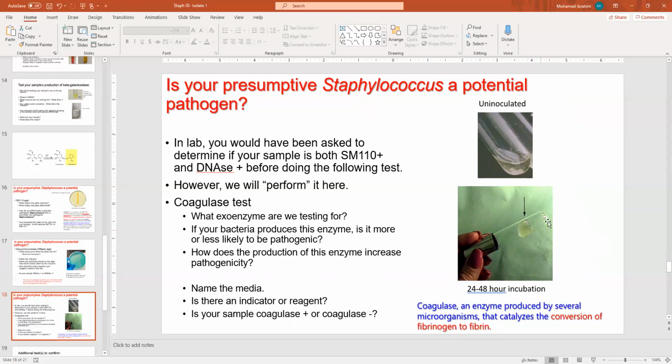this kind of coagulation. So you will end up with the rabbit plasma, which is kind of liquid at normal room temperature, going to coagulate and be like a jello like that. Okay, so some dangerous pathogenic bacteria like Staphylococcus aureus have this capability. They produce coagulases, so they can convert fibrinogen in the plasma to fibrin that will coat them.